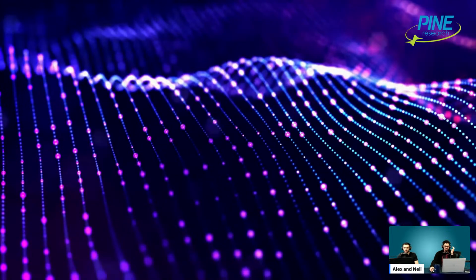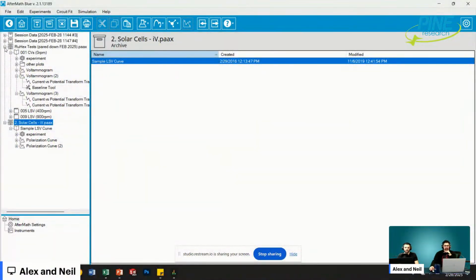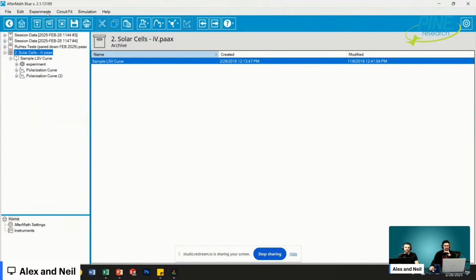Naresh was following up if it's diffusion controlled, how does it be in terms of RSWs? Okay. I can just show you in our software, I guess. And similarly, Muhammad is asking about how to plot simulation for EIS equivalent circuits. Now we don't have free software, so I don't know if we can help you with that, but we can still show you how we use it in our software. It's not exactly the same, I get it, but circuit simulation.